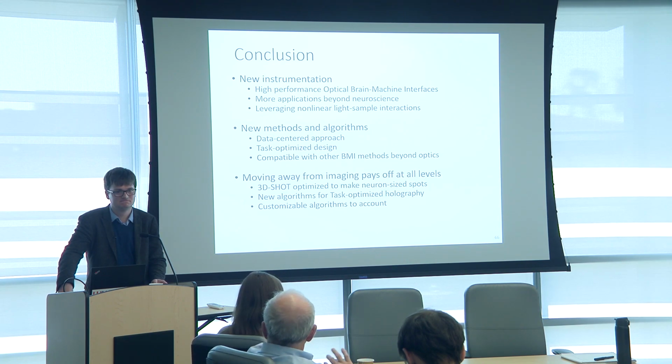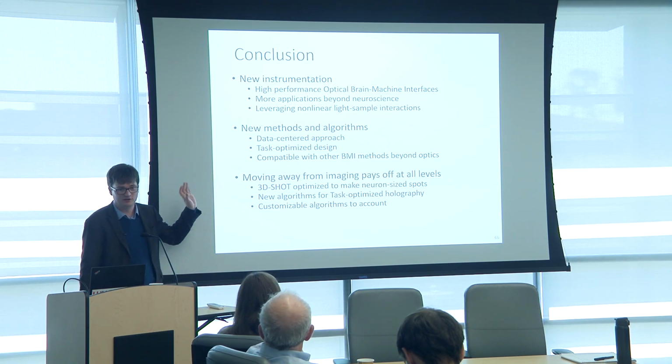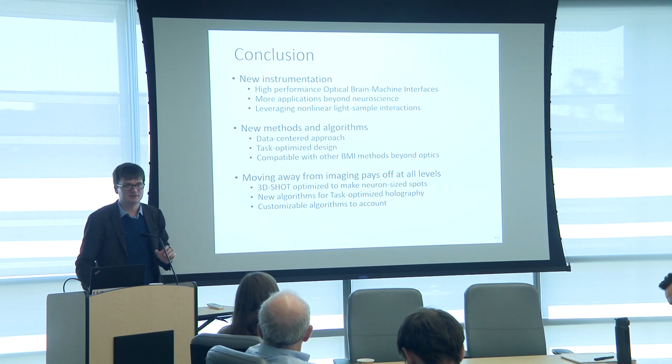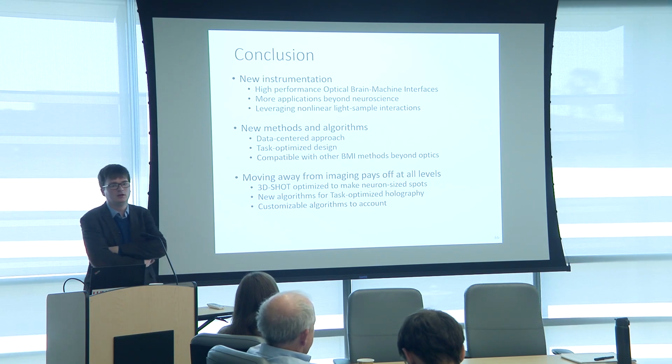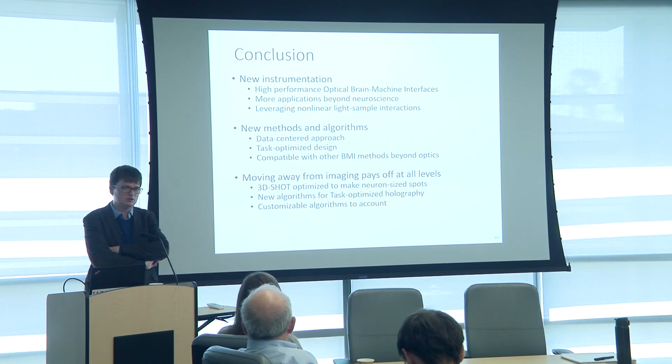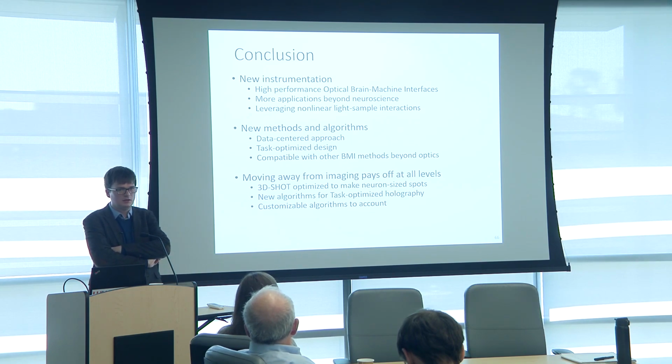These SLMs are all transmission? No, they're reflective SLMs. Sometimes I display them as transmissive elements for clarity on the object. They're typically liquid crystal on silicon, so it's a silicon base that's reflective. There's a liquid crystal that's deposited on it, and typically an anti-reflection coating on top. Most SLM technology that has high diffraction efficiency and speed is typically reflective.